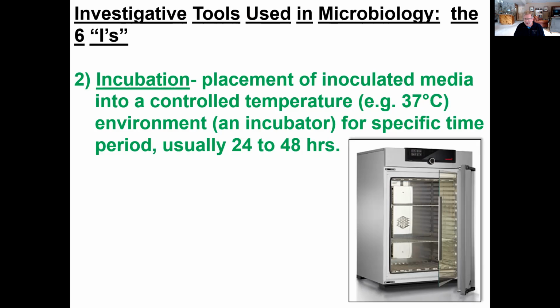We have several incubators in the laboratory. And the ones that we'll be using 90% of the time are incubated at 37 degrees Celsius, which I hope you know is body temperature. We will be doing a lab toward the end of the semester where we place bacteria into different temperature regimes. We use, I think, 3 or 4 different incubators at different temperatures, and we see what effect temperature has on growth. So we'll be talking more about that in an upcoming chapter.